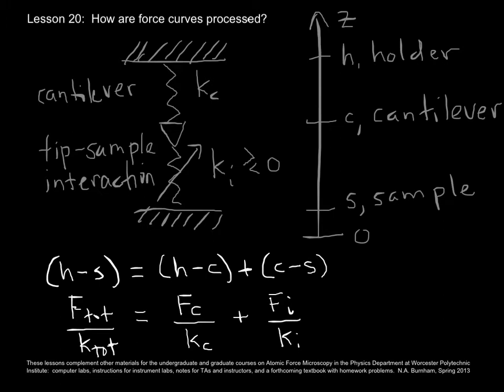Now, something really cool. If you remember Newton's third law, that says for every quote-unquote action force, there's a quote-unquote reaction force.